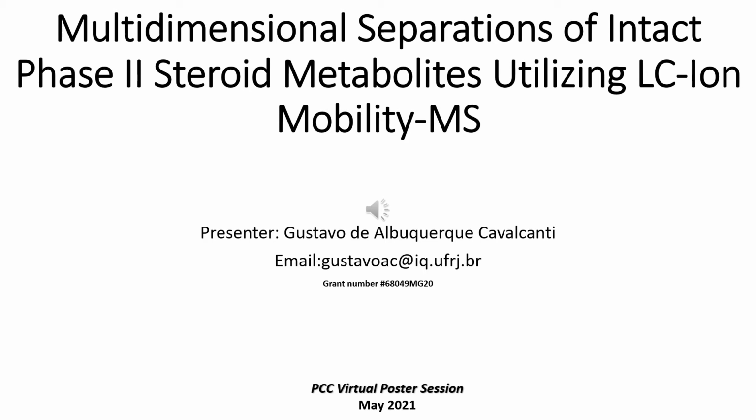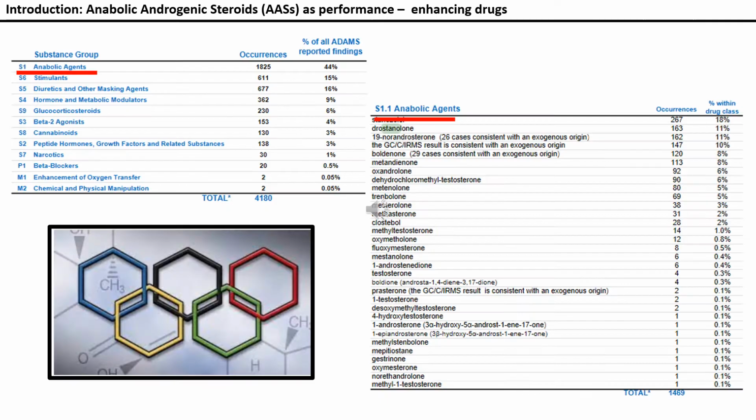Today I am talking about the project funded by PCC that is in progress, and I'm working on it with Professor John Macklin and his research group from Vanderbilt University. Basically, this project deals with ion mobility spectrometry in steroid analysis.